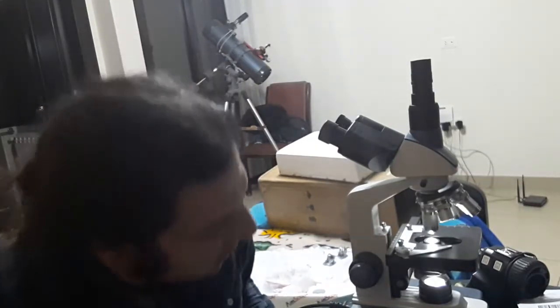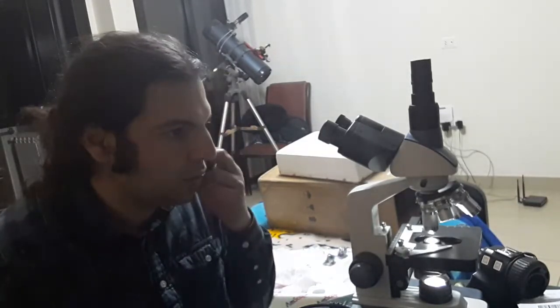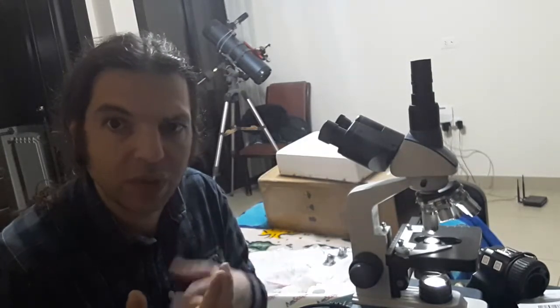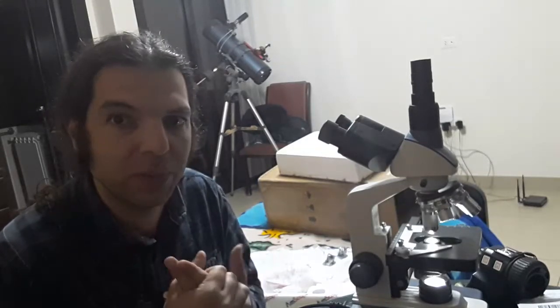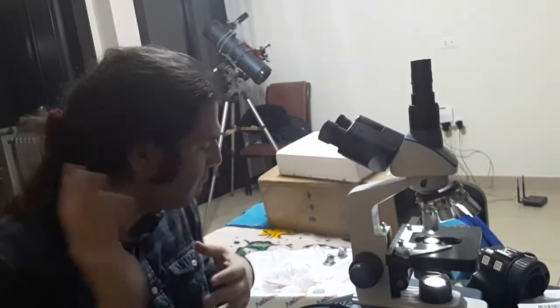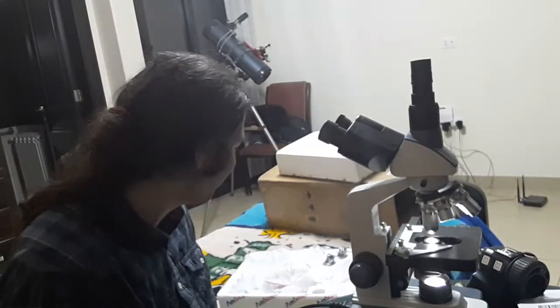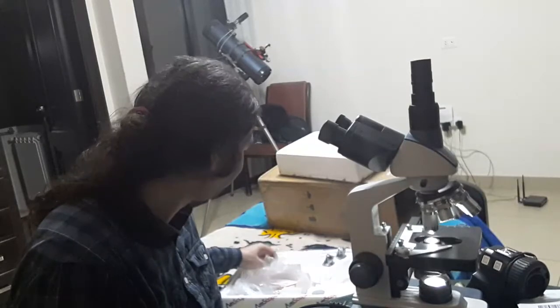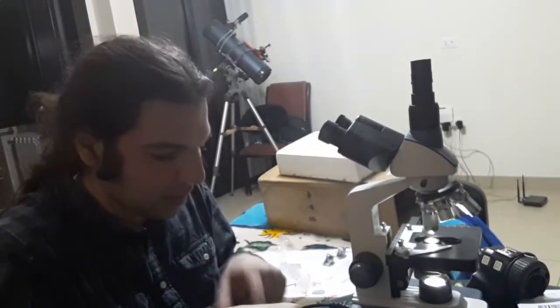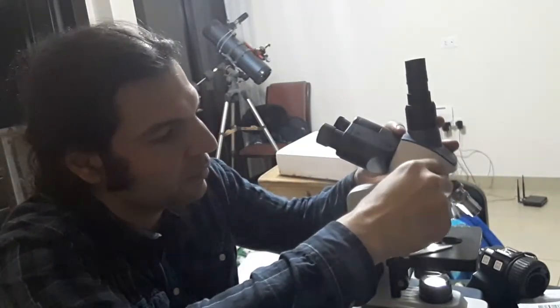There are a number of color filters available — blue, red, and others. You can also use filters that come with a telescope on a microscope. Let me install the blue color filter for the first time so you can see how it goes.